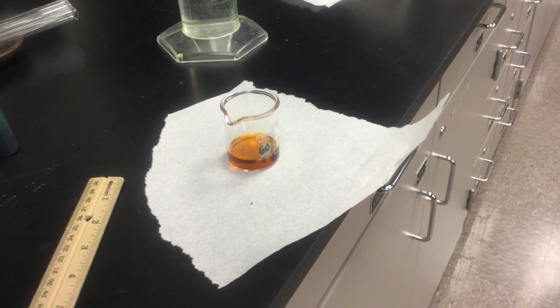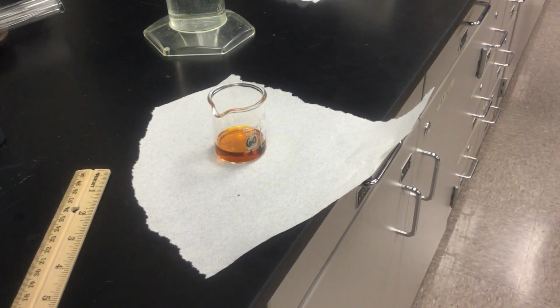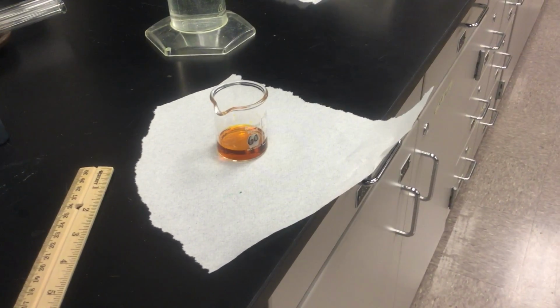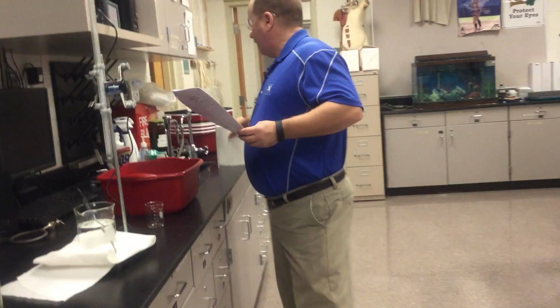It's definitely not green. It's kind of a burnt orange color, a lighter yellow color. So, we got that. Make note of that somewhere on your lab, because there'll be questions about that later on.